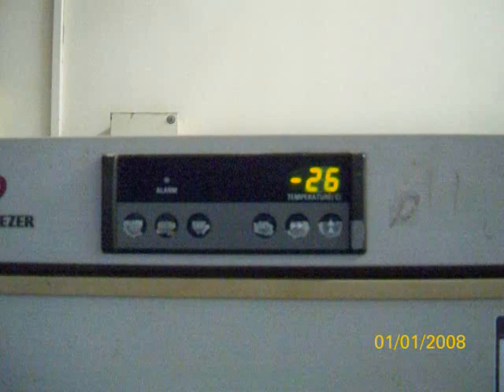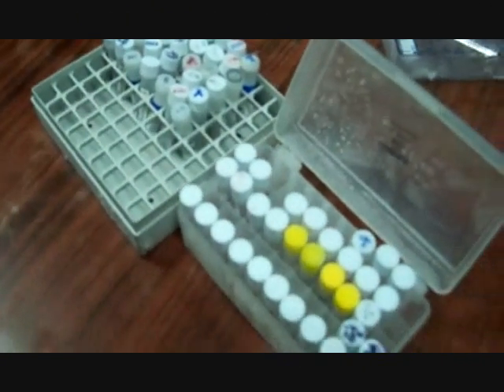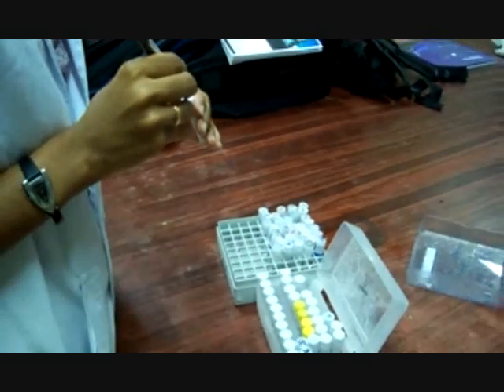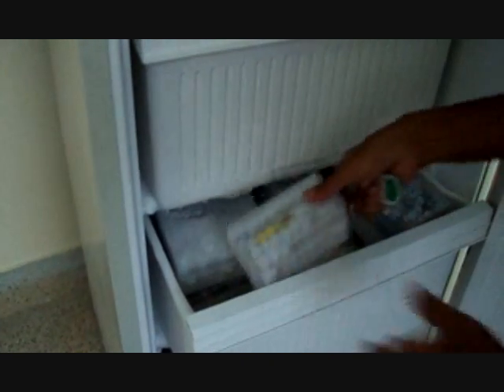The samples stored at minus 30 degrees Celsius are for short-term storage. The enzyme kits are properly labeled and stored at minus 30 degrees Celsius. Samples stored at minus 30 degrees Celsius include enzymes, dNTPs, primers, DNA ladders, protein markers, and plasmids.